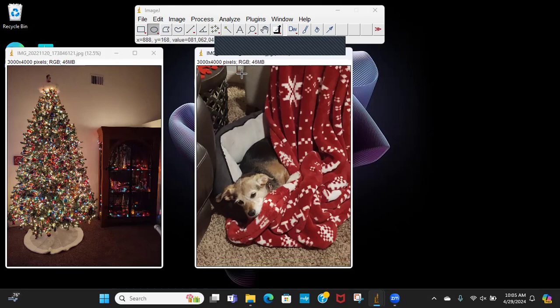So there's a high resolution there, but if you were to decrease the size of the grid or pixel quantity, you would lose some sharpness in the image and it would become blurry. But if you were to increase the number of pixels within that same size, there would be increased resolution. And when you zoom in on an image, the quality would remain and the image wouldn't become blurry.